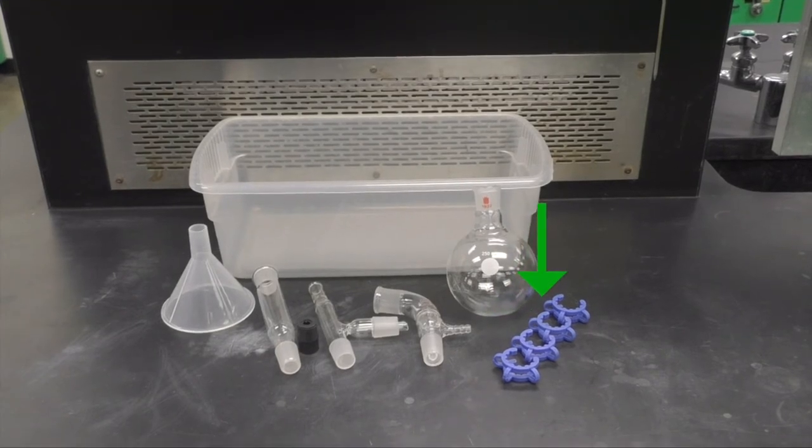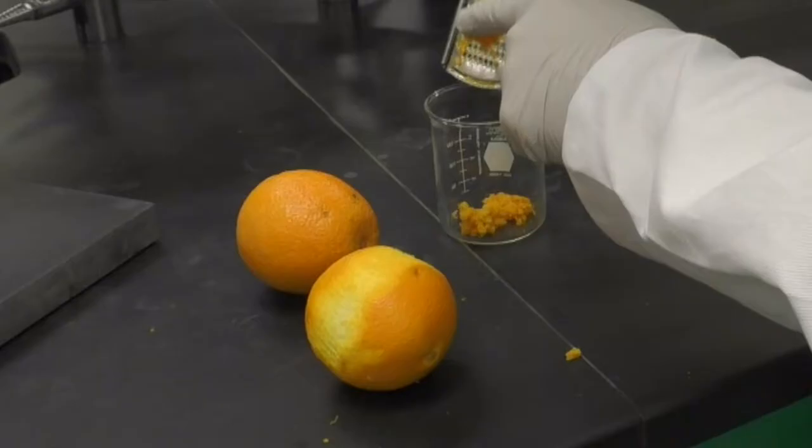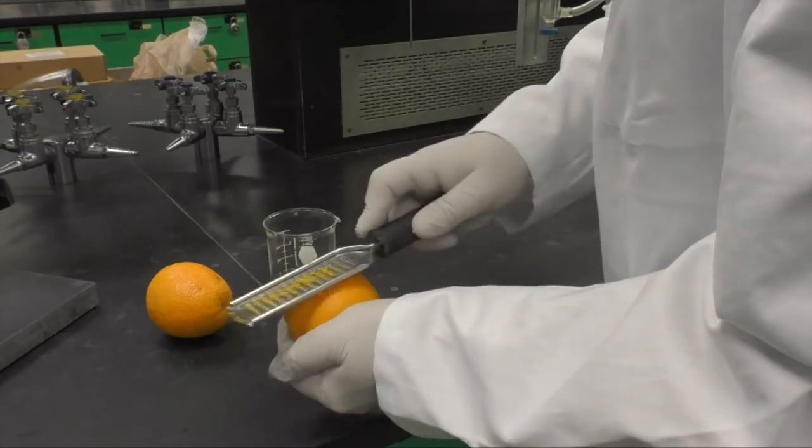You will have brought in two or more oranges to supply the zest needed for the isolation. The zest of a fruit is the very outer layer. When removing the zest, try to avoid the next white layer known as the pith. To remove the zest, you will need a zester and a beaker.